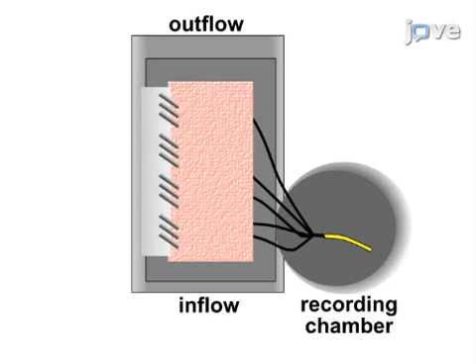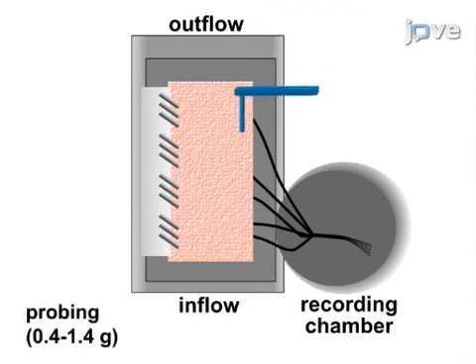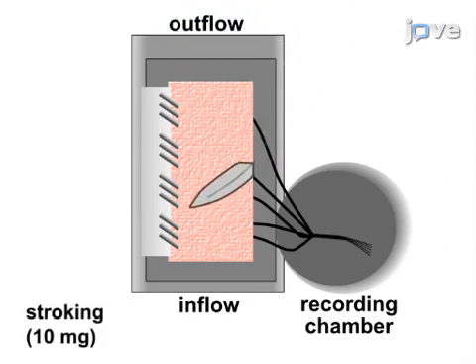As a second step, the pelvic or lumbar splanchnic nerve trunk is split into fine filaments so that single fiber electrophysiological recordings can be made of individual nerve axons. Next, individual colorectal nerve endings are identified by unbiased electrical stimulation of the receptive fields and functionally classified based on their response profiles to 3 distinct mechanical stimuli.